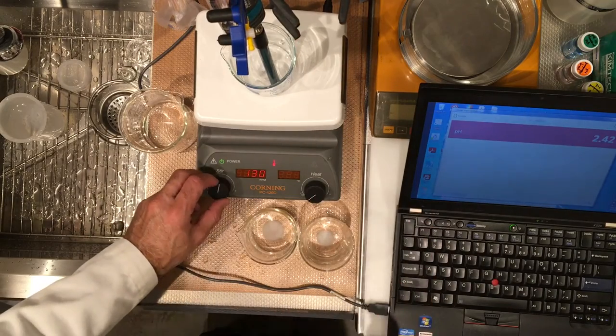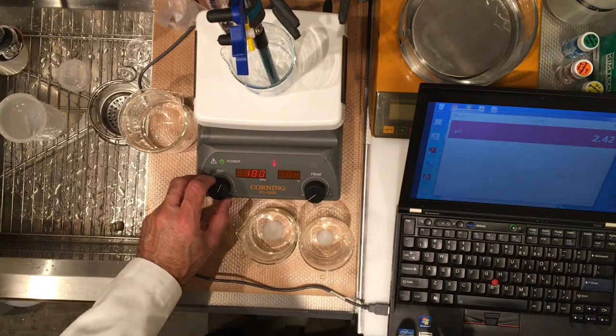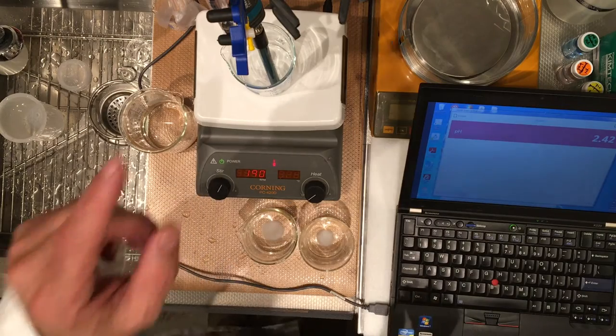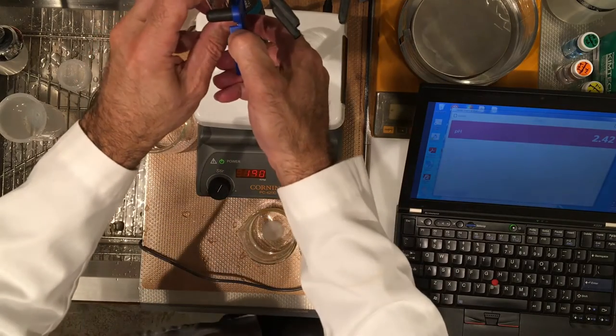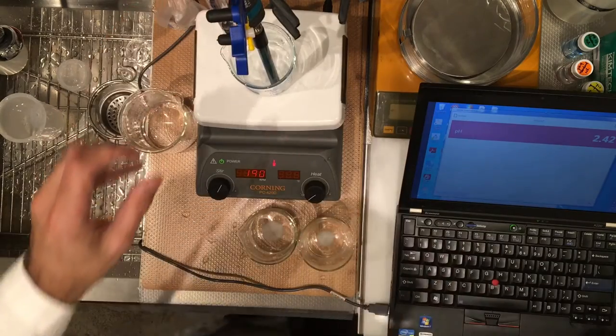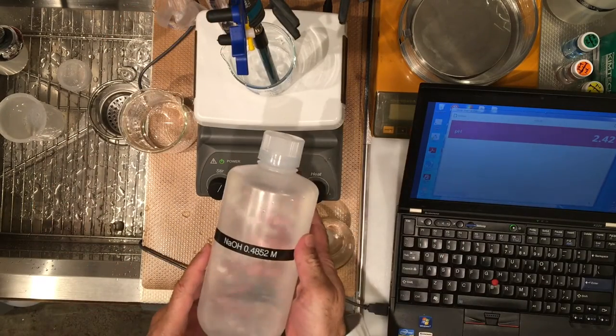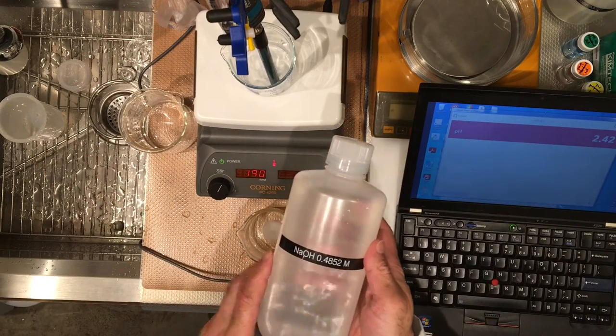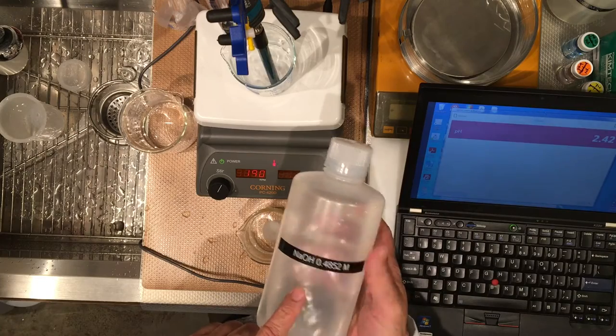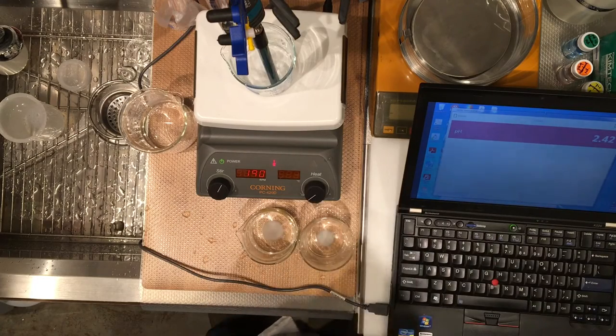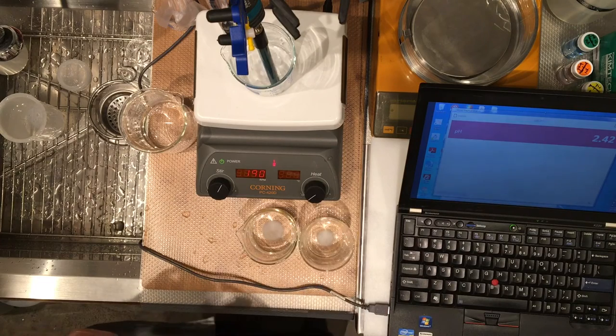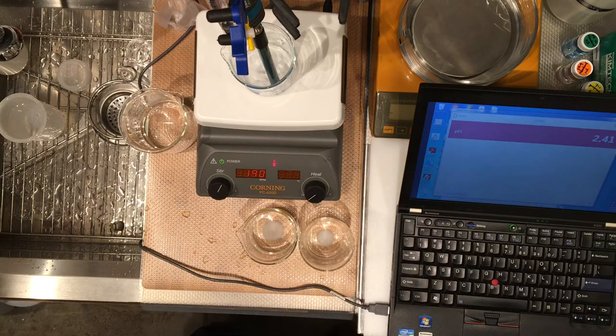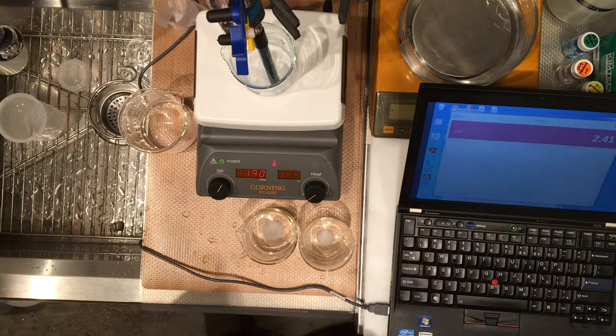So, okay, we are going to start our first titration. The burette has sodium hydroxide in it, ready to go. The concentration is 0.4852 molarity, already standardized with KHP. So, we can rely on this concentration to four sig figs. You have your masses.